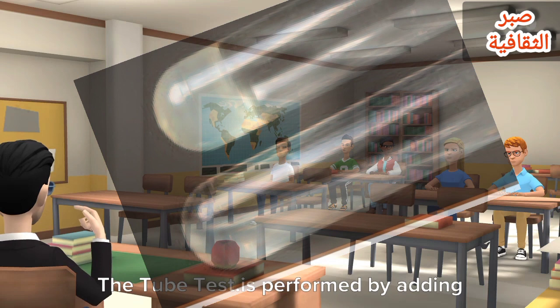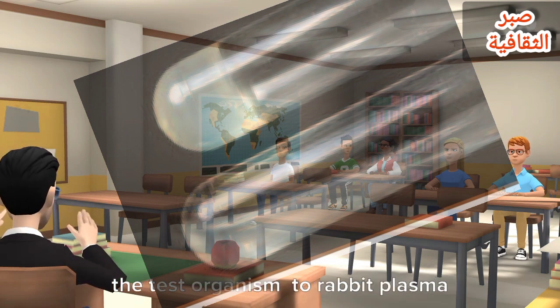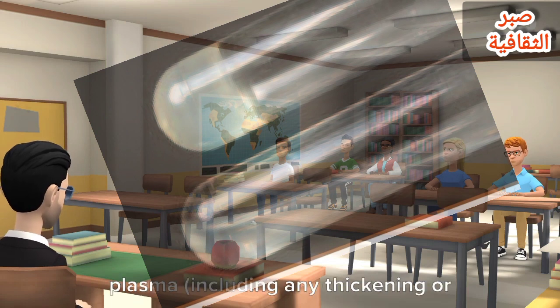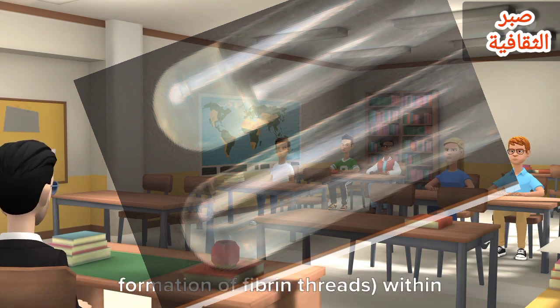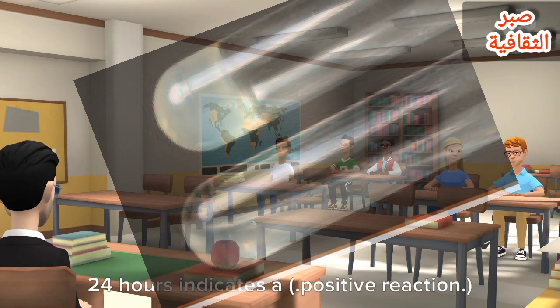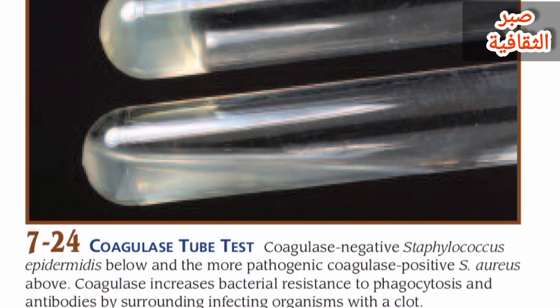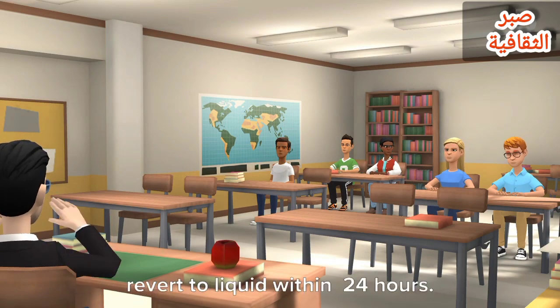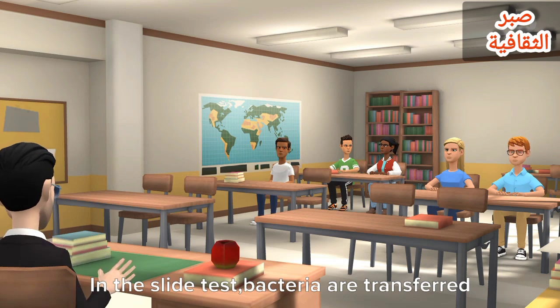The tube test is performed by adding the test organism to rabbit plasma in a test tube. Coagulation of the plasma, including any thickening or formation of fibrin threads, within 24 hours indicates a positive reaction. Figure 7-24. The plasma is typically examined for clotting without shaking after about 4 hours, because it is possible for coagulation to take place early and revert to liquid within 24 hours.